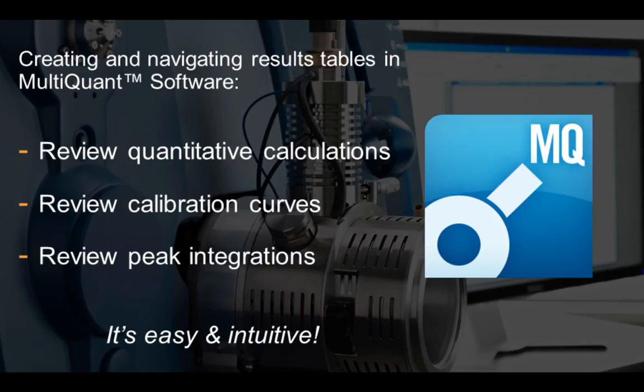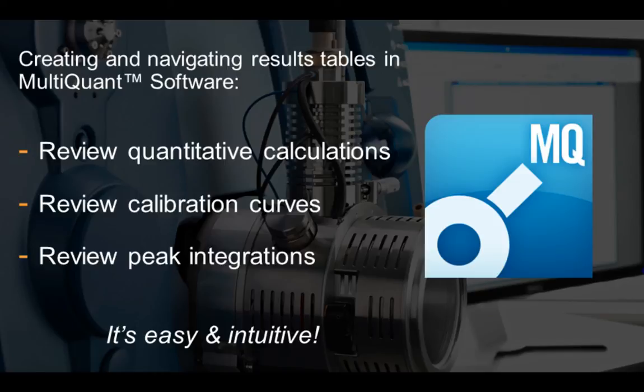As you can see from this short video, creating and navigating results tables for multi-component analysis using MultiQuant is very easy and intuitive for your quantitative data processing.